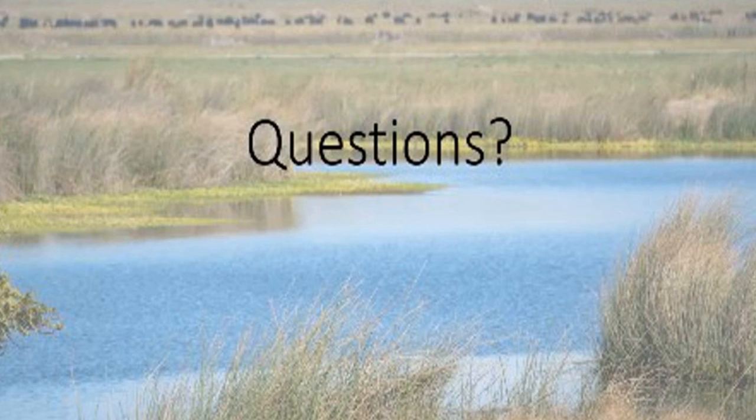Got it. Yeah, like Sean Canfield mentioned in the chat, some Sherlock assays are easier to design than others. Got it. And is there a length consideration? Obviously, with qPCR and digital PCR, we're winnowing in on a length, which can sometimes be limiting. For CRISPR, are we really short, or is it kind of medium? I might defer that to the chat for Sean. Okay, great. I'll follow up. I'd love to learn more. But that's exciting to hear that sometimes it can be, it sounds like from Melinda, 6 months for a new design. So that's great to hear. Awesome. Okay.